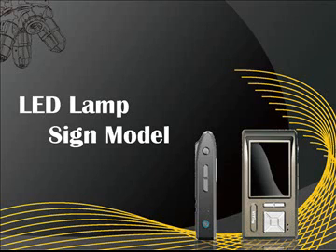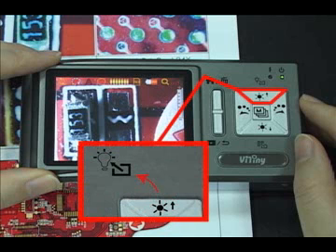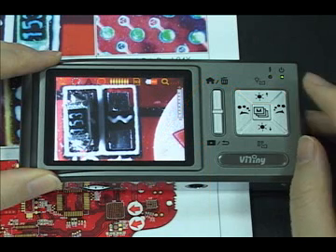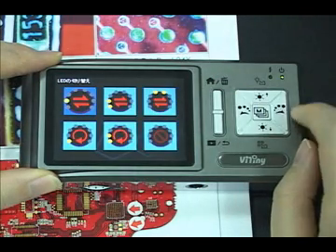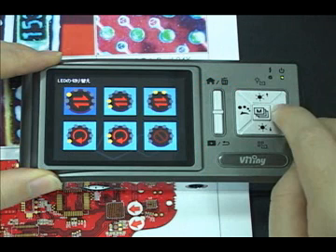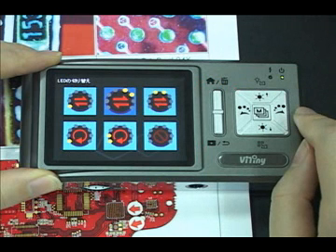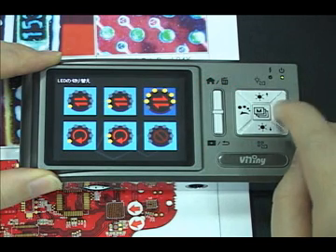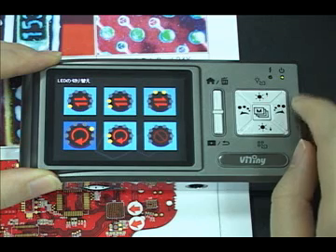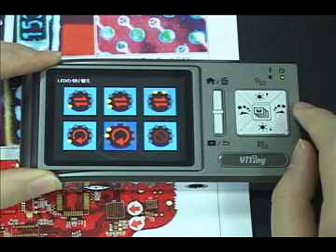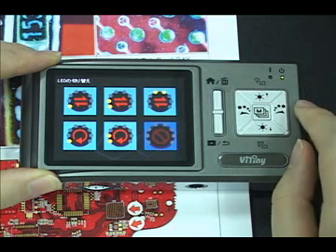LED lamp sign mode: press and hold the up button to switch lamp sign mode. It has six modes — manually switching mode to light one lamp, manually switching mode to light two lamps, manually switching mode to light lamps progressively, automatic repetition mode to light one lamp, automatic repetition to light two lamps, and no lamp lights.